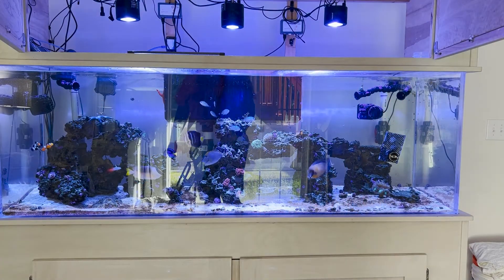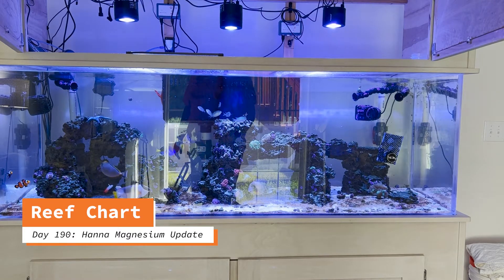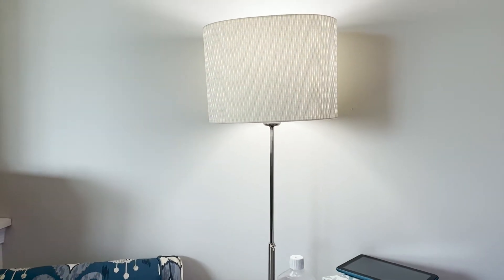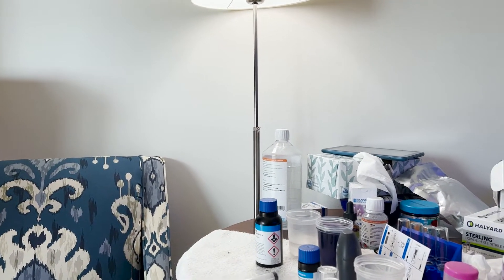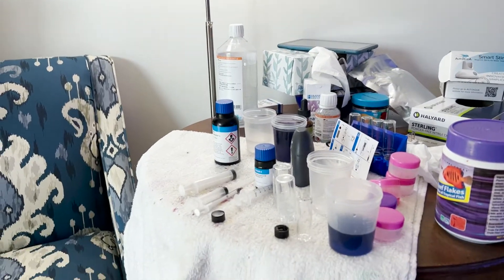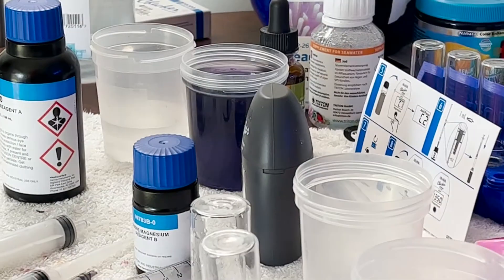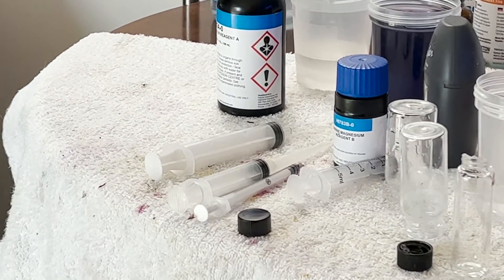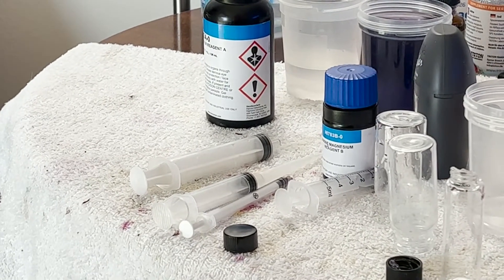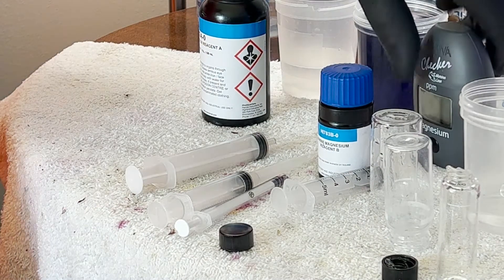Good morning everybody and welcome back to the reef. I spent the last hour or so playing with the Hanna magnesium checker. Some people reached out to saltwateraquarium.com and to Hanna and looked for a solution. The solution posted was that if you remember, it read to use four milliliters of reagent A. Hanna stated that we should increase reagent A to five milliliters.